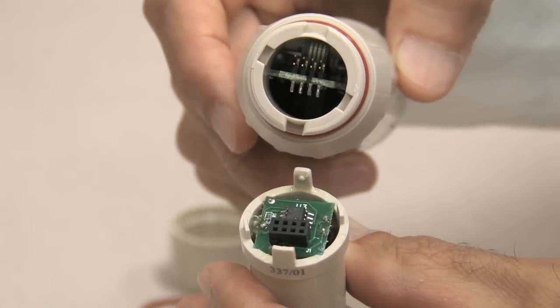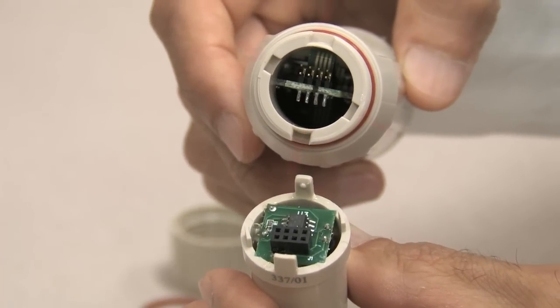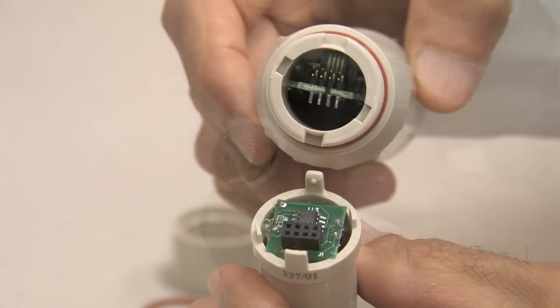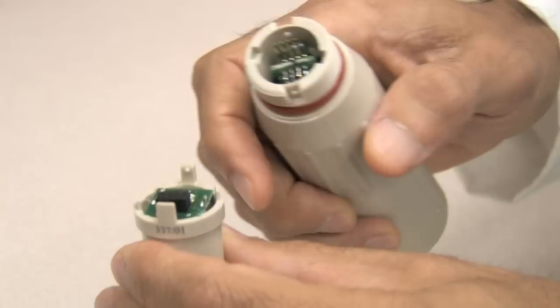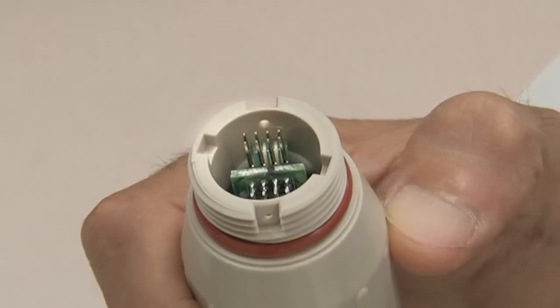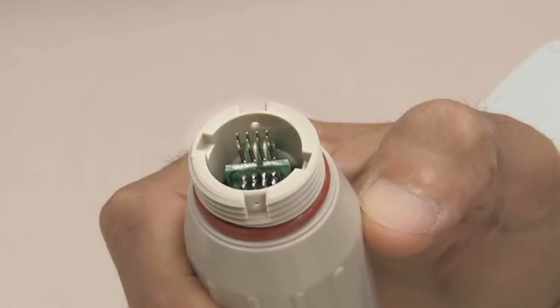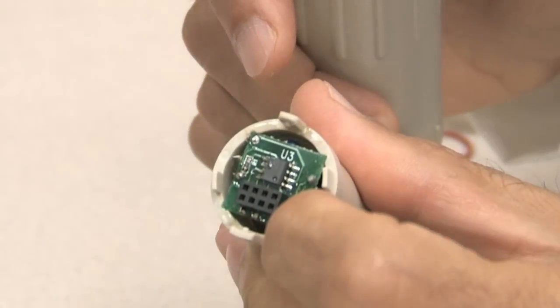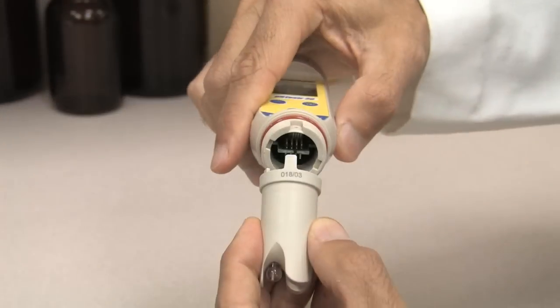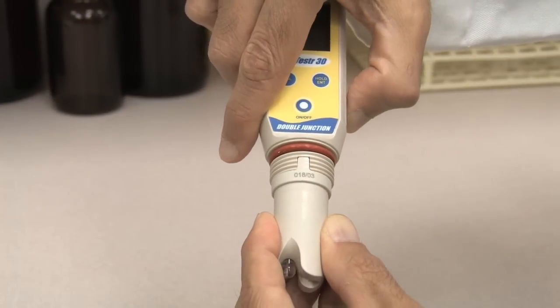Take the new electrode module and align its four tabs to match the four slots on the tester. Two of the tabs are dimpled to match the keyholes in two of the slots on the tester. Notice the eight gold-tone pins inside the tester — align these with the black eight-slot electrical connector on the new module.